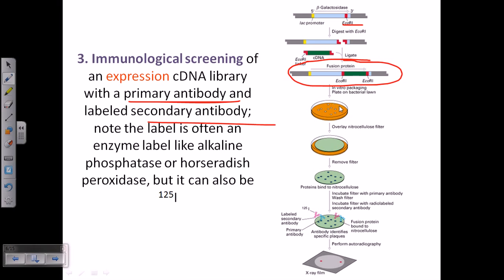Now this is the plate. So this is our cDNA library, from where we start our screening. So this is the result, this is the cDNA library. Now what we know about this, we need to screen for our desired gene.